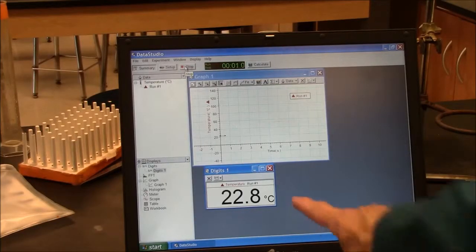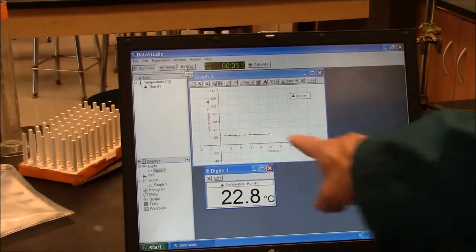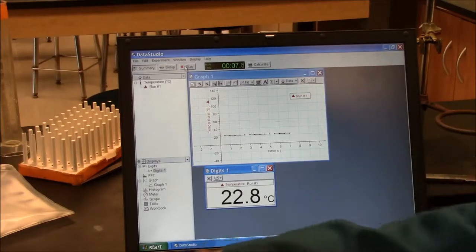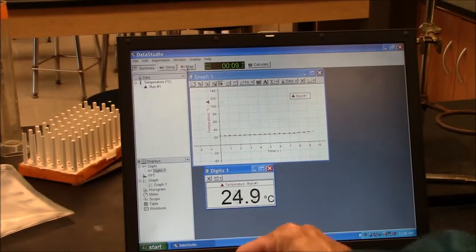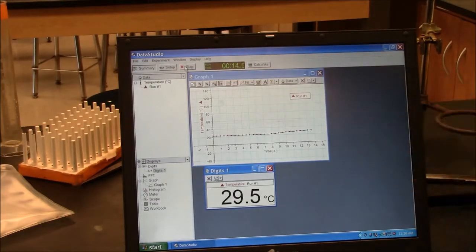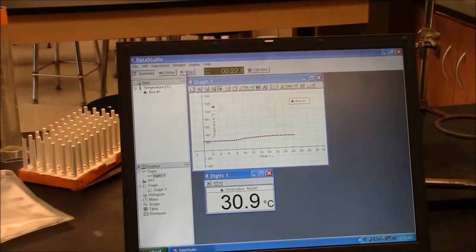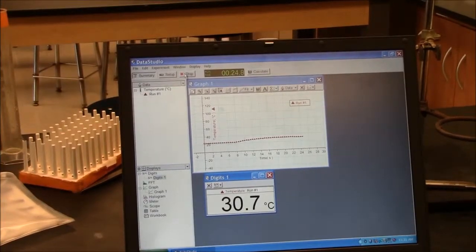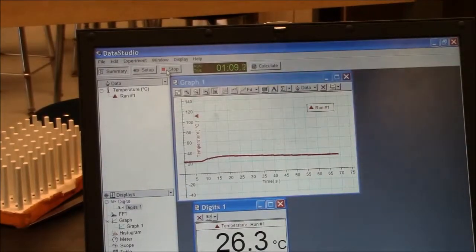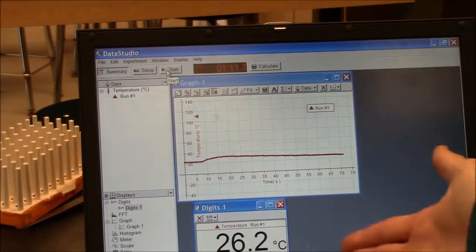Click. You can see it's starting to read temperature here, and it's starting to graph. If I warm the temperature probe, the temperature rises. The graph also rises. So this is a very handy way of collecting data, especially when the temperature is fluctuating. Some time has passed. I'll now click on stop. So now it stops reading.